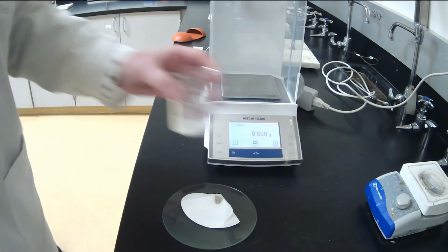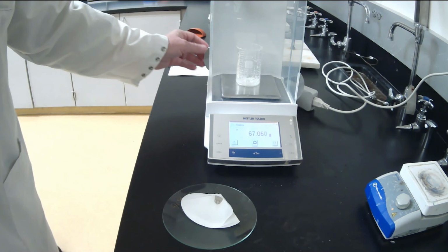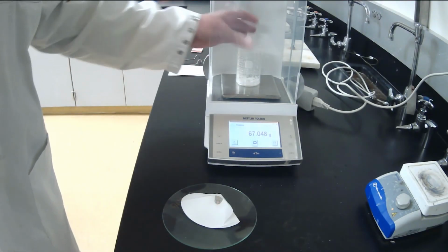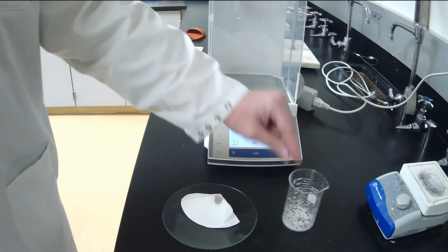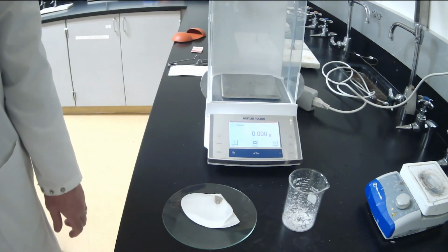And now we're going to take the beaker, which is in lieu of the evaporating dish. So this is our beaker plus our salt that goes on the line with the evaporating dish. Can you see the number clearly? Record that in your notebook. We have finished recording the data, so now we have successfully separated the salt from the sand, from the ammonium chloride, and you should be able to do all the calculations.